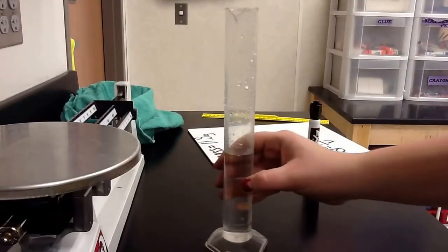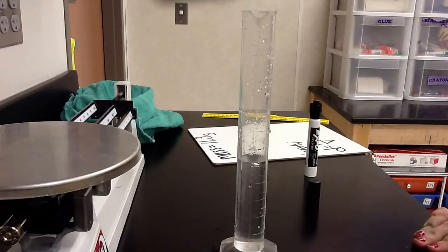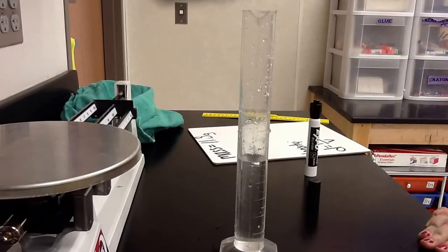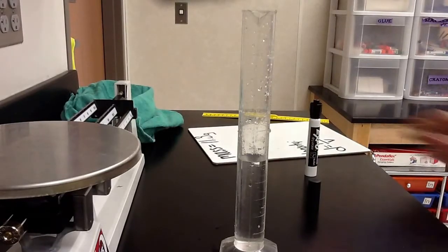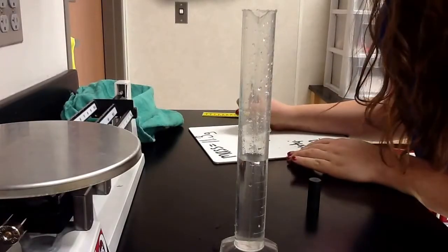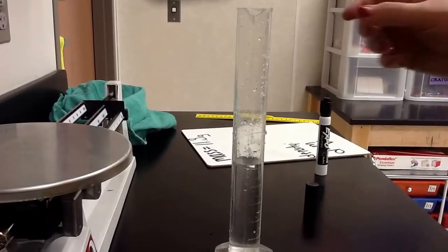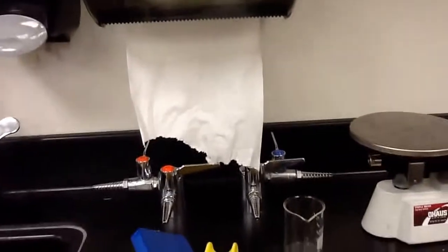So you have to read the volume. You do that by getting down eye level and reading it. You have to read at the bottom of the meniscus. So this one says 51, and I'll show you in just a second. So it's starting at 51 milliliters. You never want to hold the graduated cylinder up to your eye.